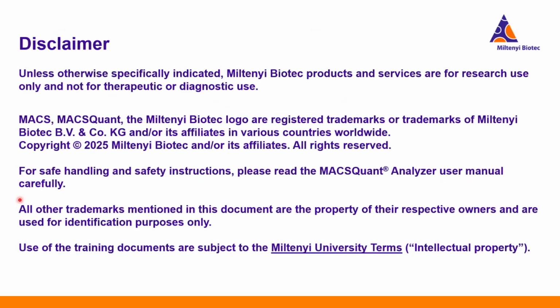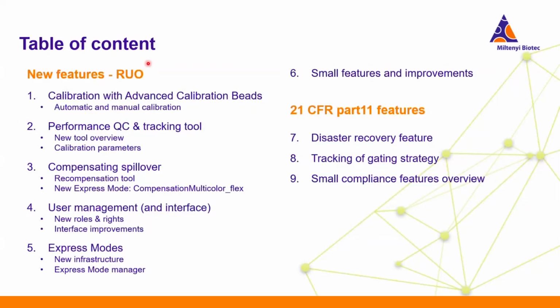Please acknowledge our disclaimer. We structured the webinar in the way that we first focus on the changes which apply to every user. So it's research use software features, but of course they also translate to the 21 CFR software. And we will start with news about the calibration.